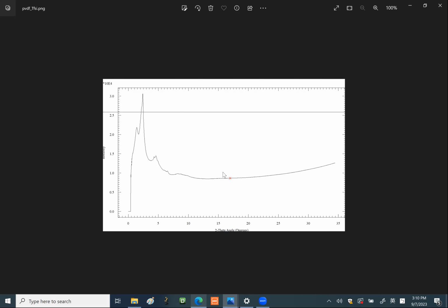Yeah, this is why there's a red cross here. I usually cut them off before 20. Yeah, so this is what I mentioned previously, that we want to throw away the garbage data during the 2D processing. We do not want to bring those garbage data into the PDF, right? So that will save us a lot of trouble when we process the PDF data.